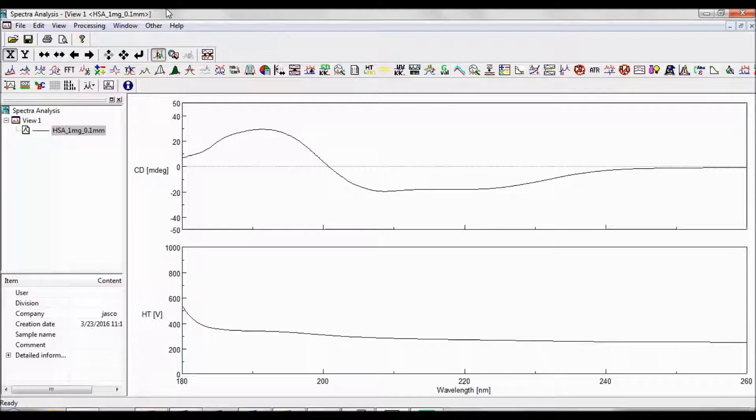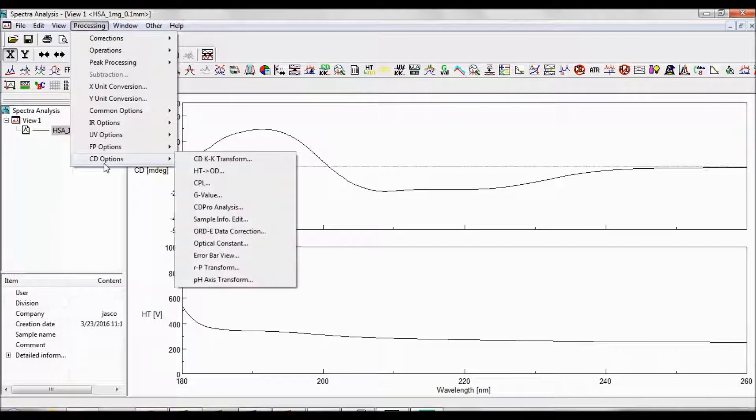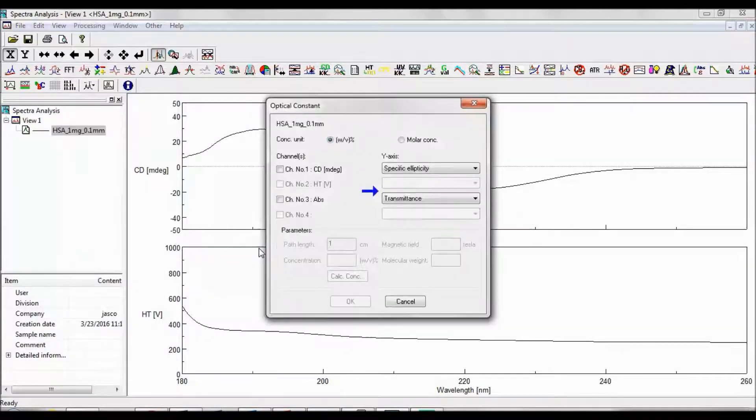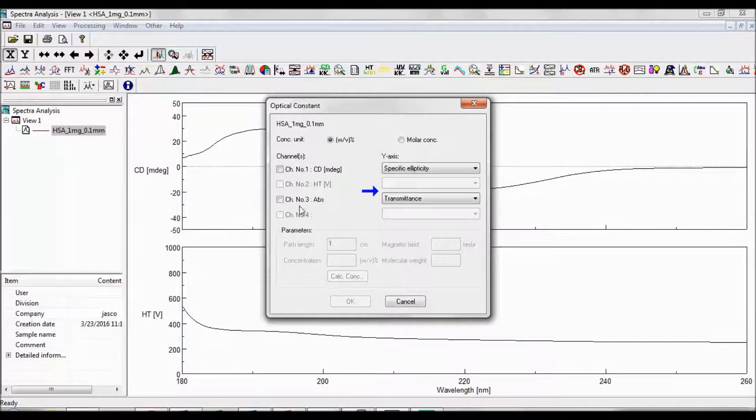Once you have obtained a sample spectrum, go to Processing, CD Options, Optical Constant. The Optical Constant menu box will now pop up.